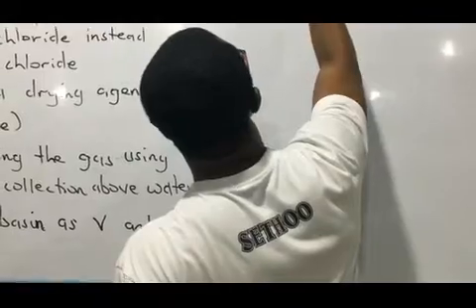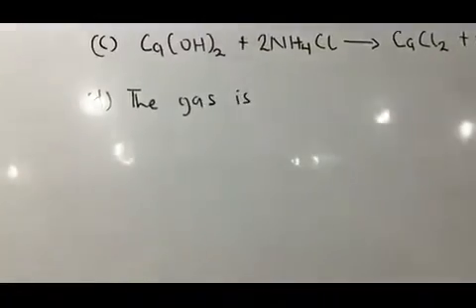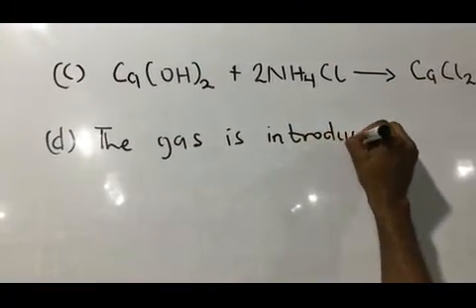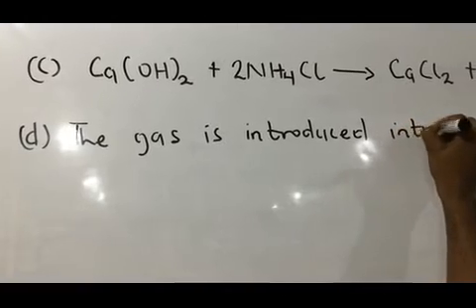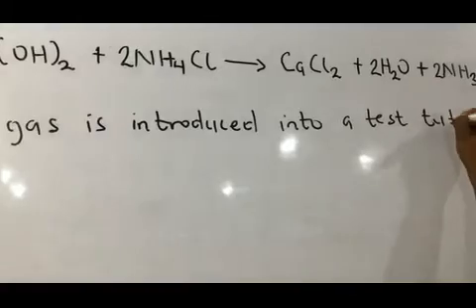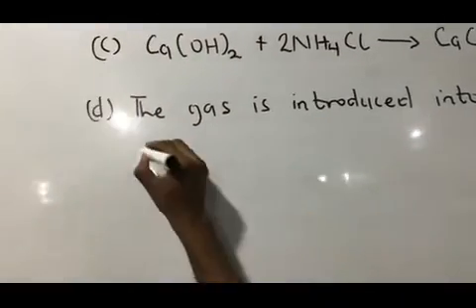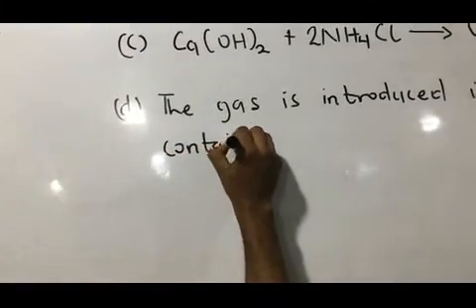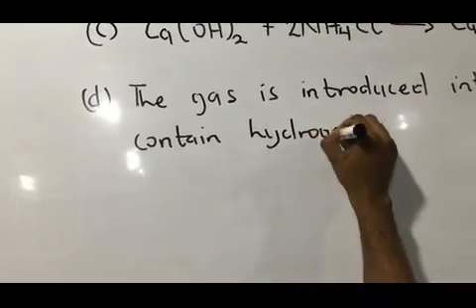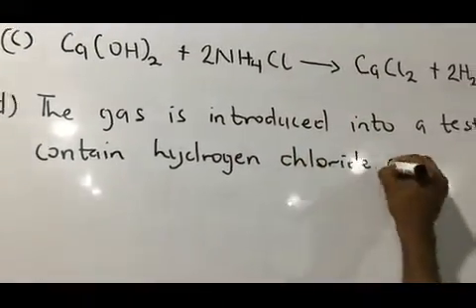So the gas is introduced into a test tube containing hydrogen chloride gas.